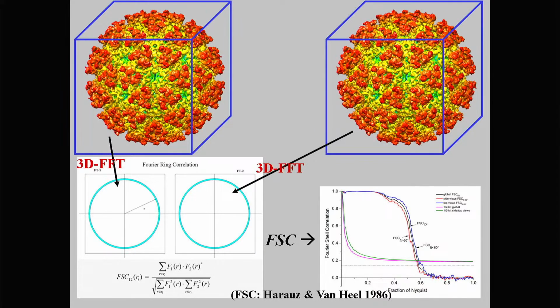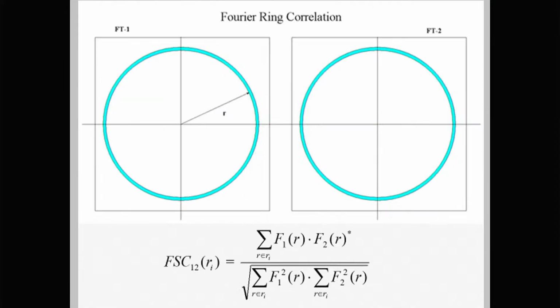At low resolution, you have very few members in a circle, and the statistics are very bad. Therefore, the threshold goes up to beyond 1 here, so this doesn't mean anything. This gives the impression that you know everything at low resolution. Actually, it's the worst part in terms of how things are defined. And maybe I'll get back to that if I find the time.